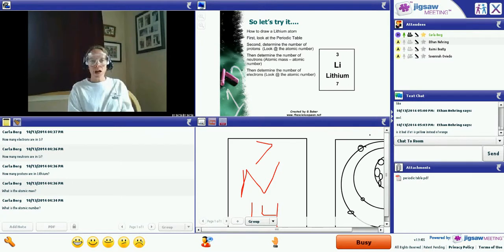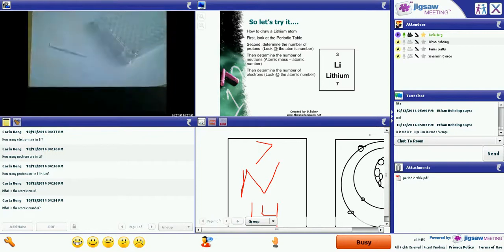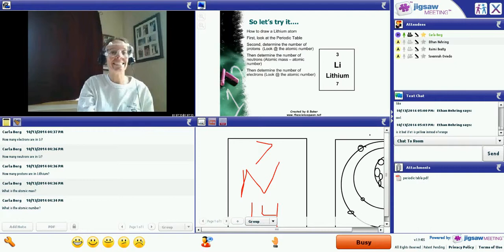Do not shake your well plate at all. If you want to get a better look at your well plate, you are going to be best off getting down next to it and looking at it from the side. Mine have absolutely no precipitate in any of them yet. And some of them are going to get precipitate. So we are going to switch to part B, and we are going to let our part A sit.